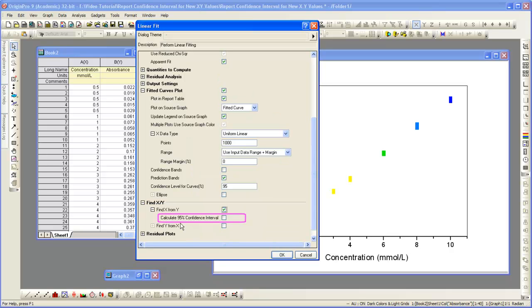We also check this checkbox here to get the confidence interval of the calculated concentration.